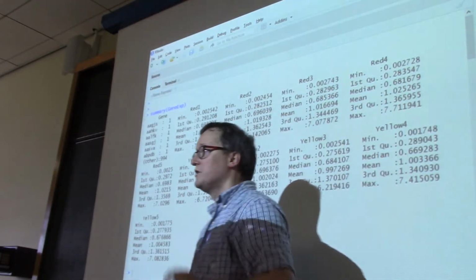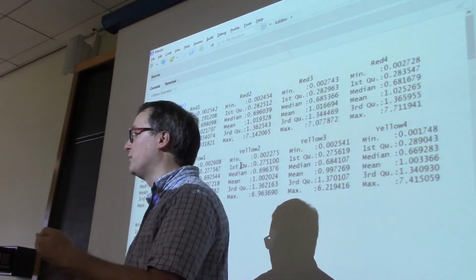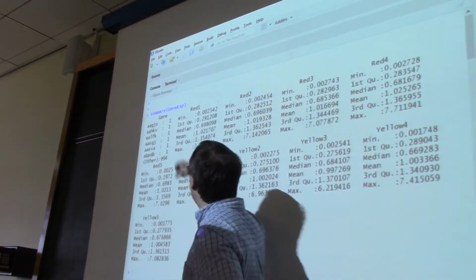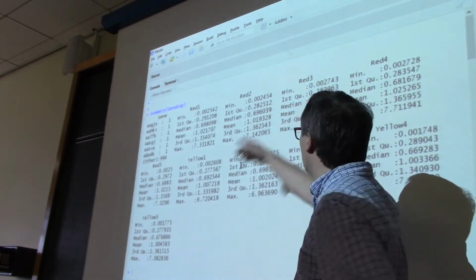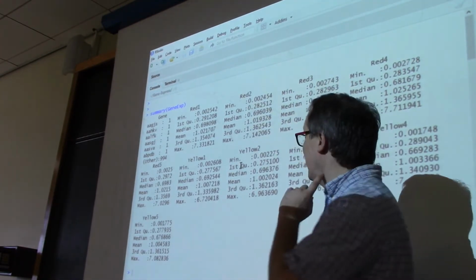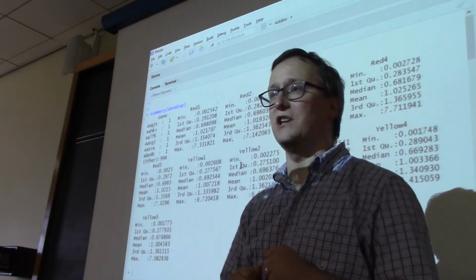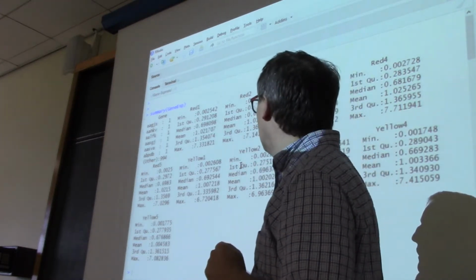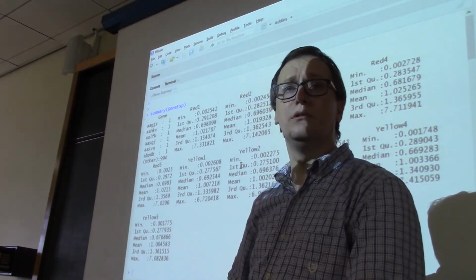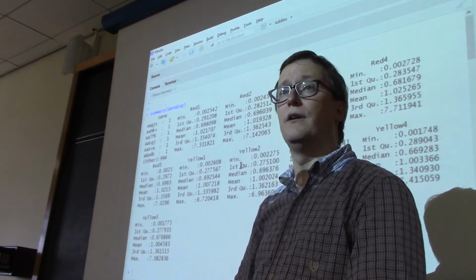All right, so having run the read table on this input file, we got back an object that has a gene field, a red 1 field, red 2, red 3, red 4, red 5, just as it was when we looked at it in Excel. So we feel good about that. I told you that it had 1,000 rows in it, 1,000 different genes. So does that correspond with what you're seeing here? Do you have a way of seeing how many different rows there are in this table? You do have one, actually.